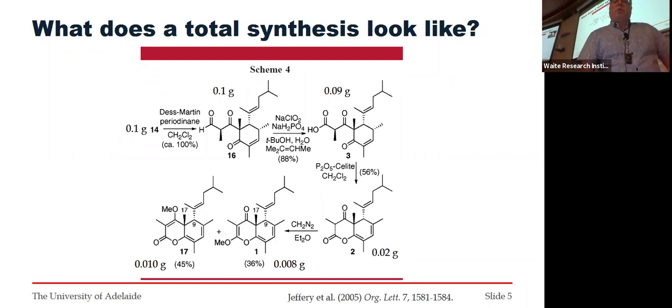But that's what we do here in the lab as well, in terms of we start out trialing a reaction maybe on 10 or 20 or 50 milligrams, not a lot of material. And typically we've got oodles to play with here. We're not talking about 20-step synthesis like I did for my PhD.